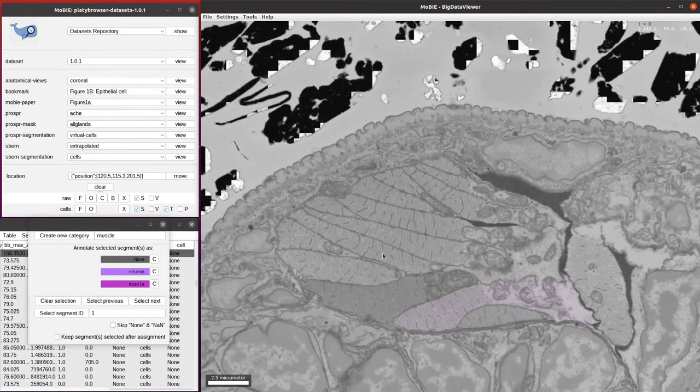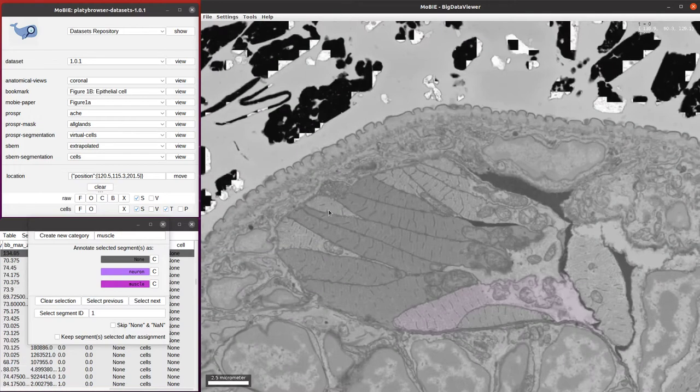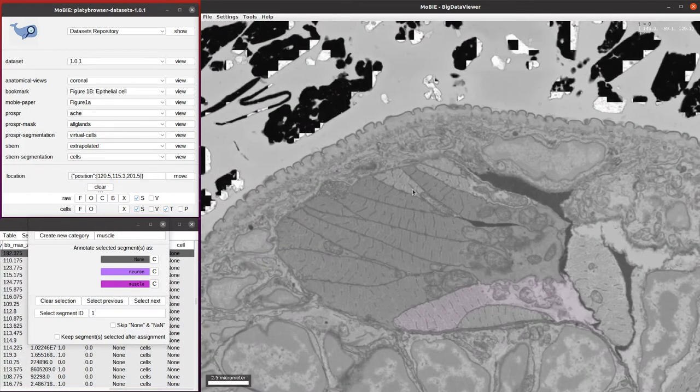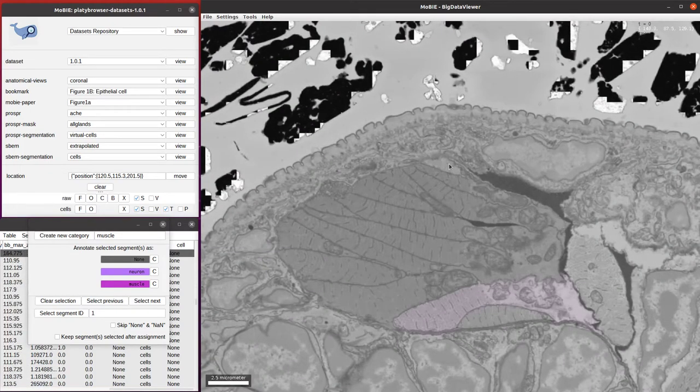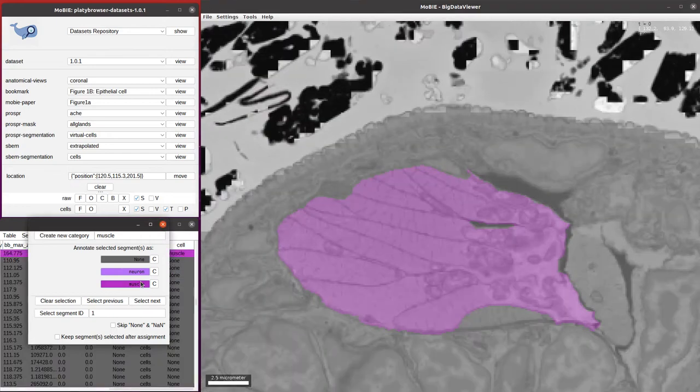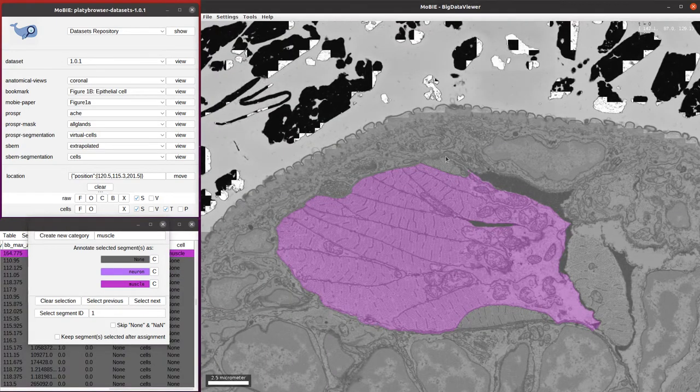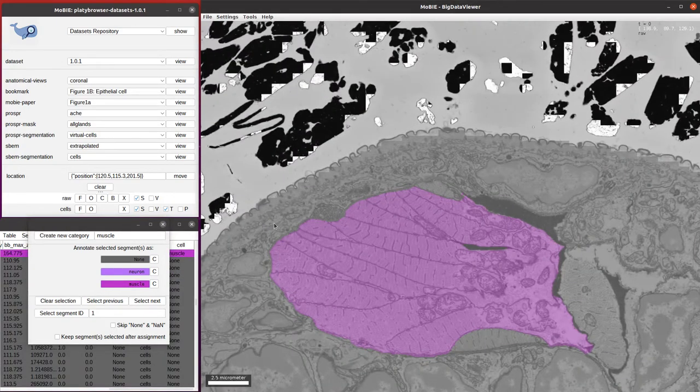Again, we can assign lots of cells in one go by selecting a whole bunch of them and then clicking the muscle button to assign everything in one go. Let's assign a few more cells.